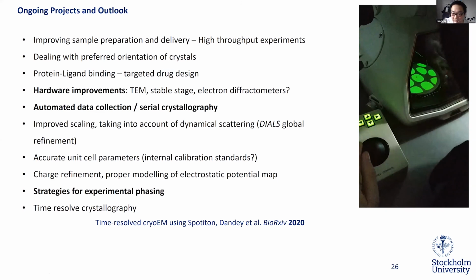So that's something I've been working on very hard, and hopefully we can bring this to everybody in the near future. And also we are working on experimental phasing and time-resolved crystallography.